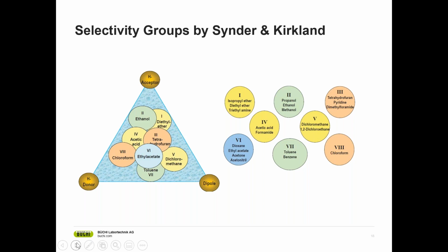In this case too, however, there is still the problem of unsuitable polarities and corresponding difficulties in mixing. Instead of polarity, Snyder used the solvent strength based on experimentally determined values. This solvent strength results in an additive change of mixing, hence we obtain a mixture of the expected strength.